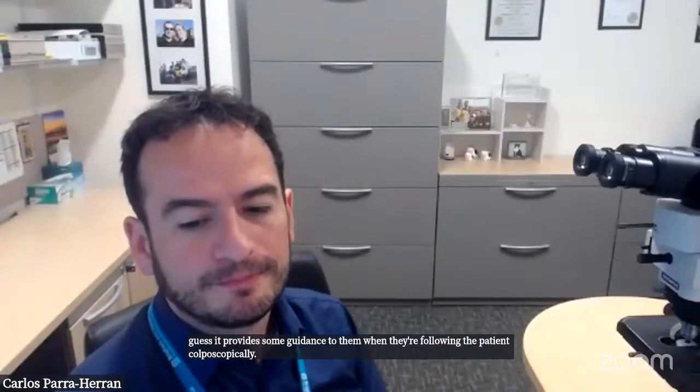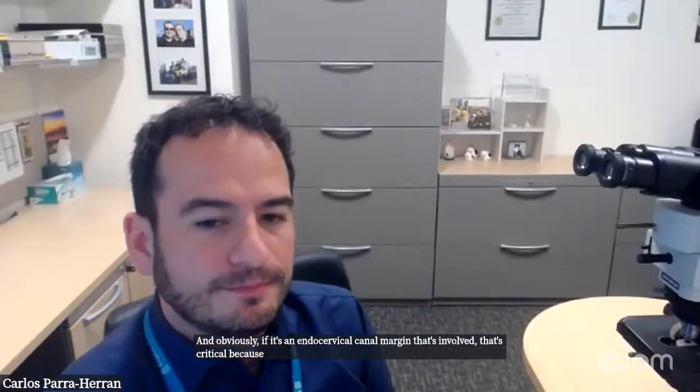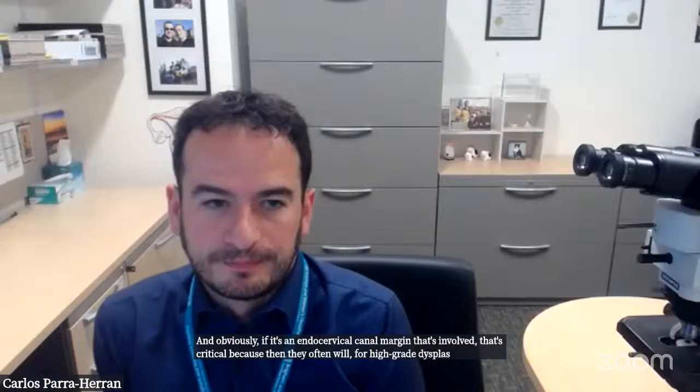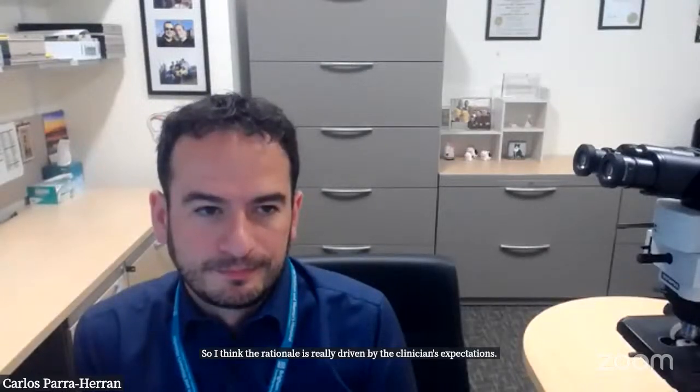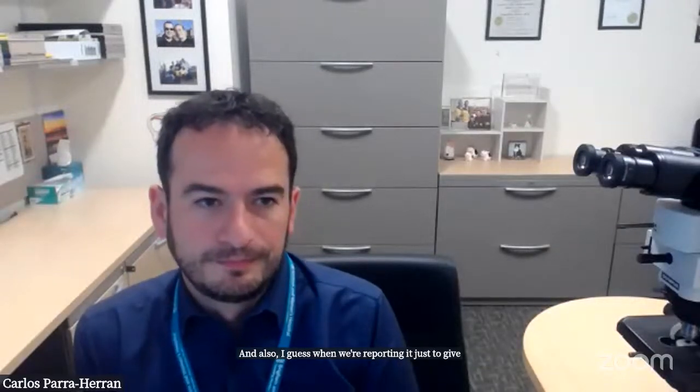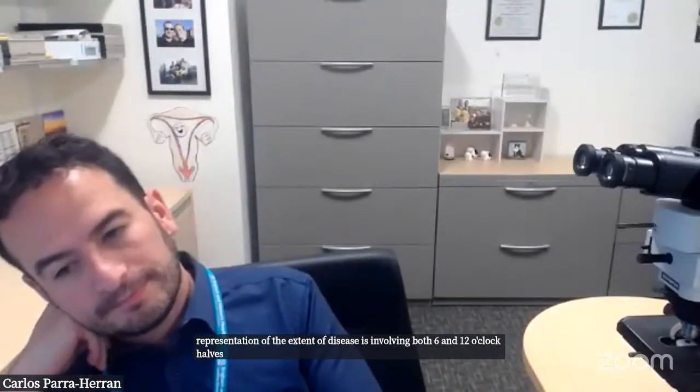And obviously, if it's an endocervical canal margin that's involved, that's critical, because then they often will, for a high-grade dysplasia, go back and re-excise. So I think the rationale is really driven by the clinician's expectations. And also, when we're reporting it, it gives a more concise representation of the extent of disease. Is it involving both 6 and 12 o'clock halves, in addition to 3 and 9 o'clock ends?